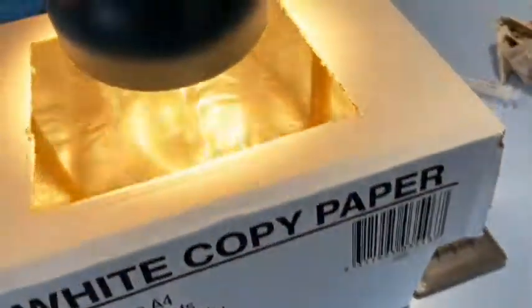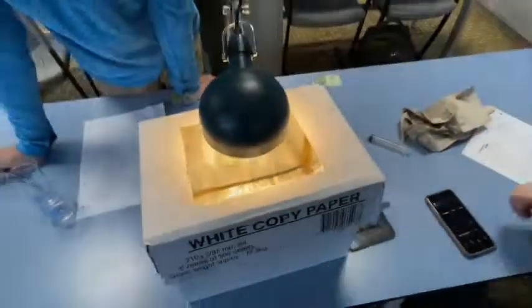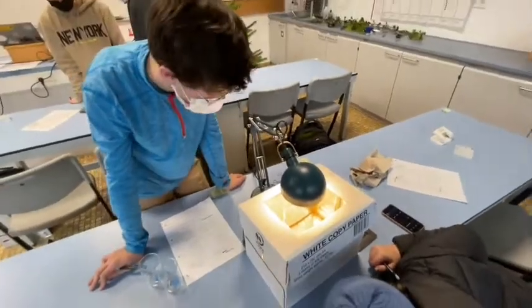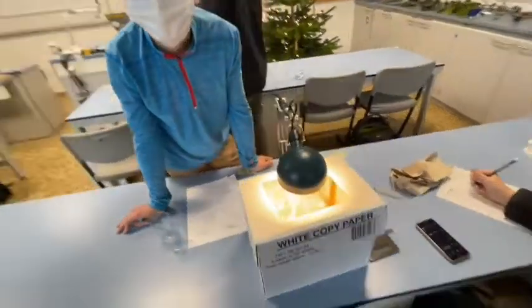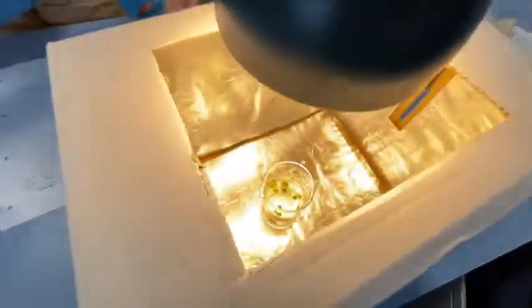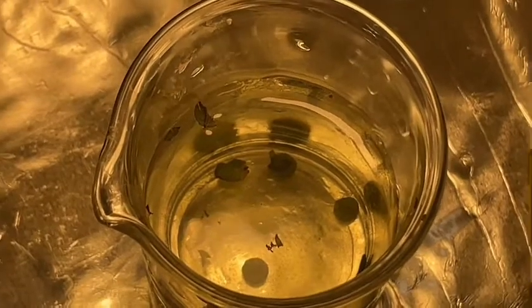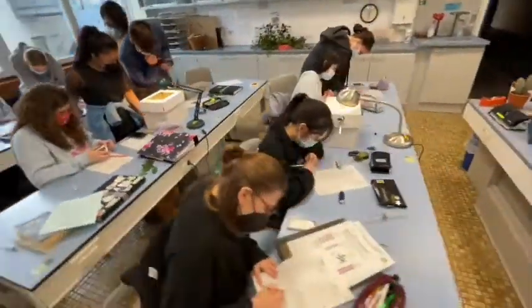Come on, float! Make me proud. So why are they floating, Sean? The leaves are taking in all this water around them, and they're splitting the water, taking in the hydrogen and spitting out the oxygen, which is actually why you can see it ripple every once in a while, completely on its own, which is really strange, and that's because it's spitting out oxygen. Caroline? Come on, Beaver! Go! Make it float! Go!